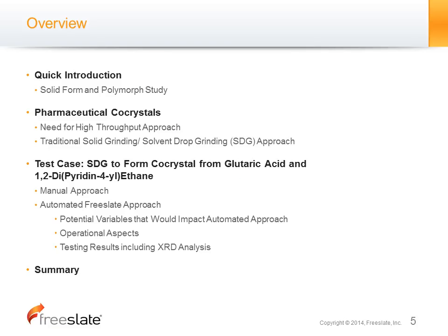So here's an overview of my talk. I will give a quick introduction of solid form and polymorph studies, and then follow up with pharmaceutical co-crystals, which is how we started this particular study or new technology development. I will try to emphasize why there's a need for high throughput research, and I will touch upon how traditionally solid grinding and solvent drop grinding techniques work.